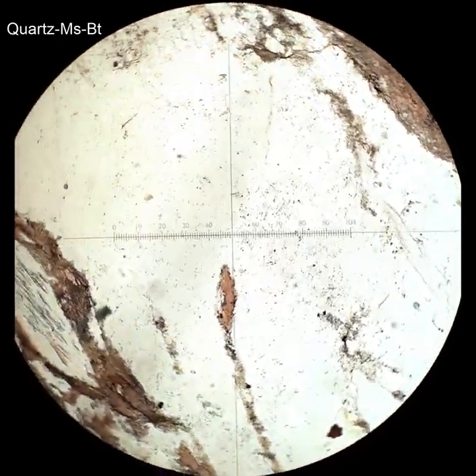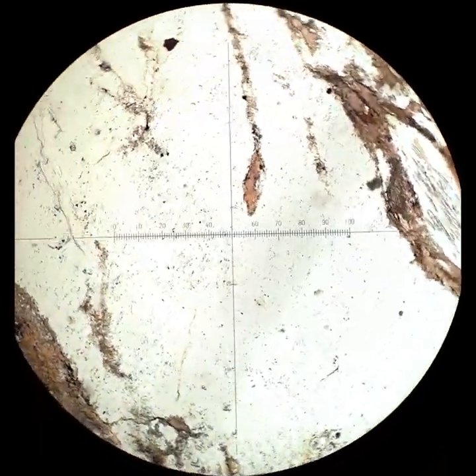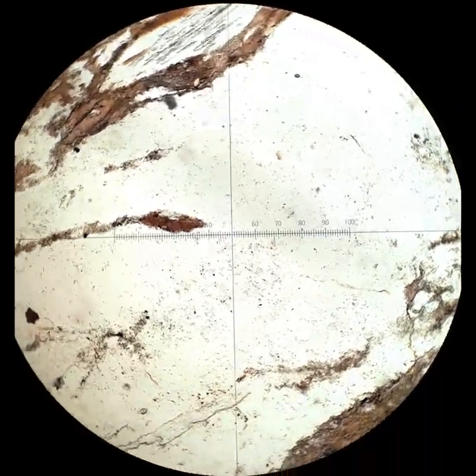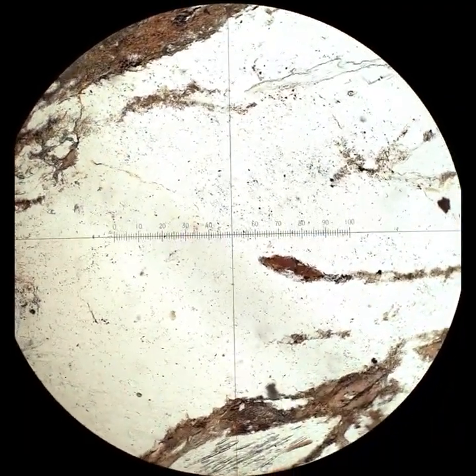And then a still more deformed example of quartz. So again, you really don't see much in plain polarized light. But as you cross the polars, you'll see that it is broken up into numerous little tiny grains, similar to the one before, just more intense.